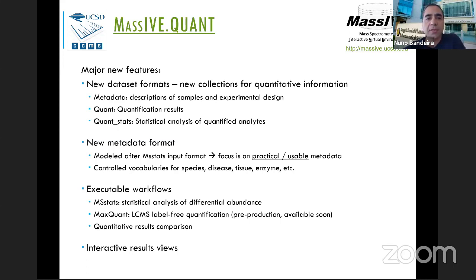So from that perspective, it also gets you a foot in the door, although definitely the preferable solution would be to have the tools that process the DIA file actually output at least one representative scan for each precursor that tells you maybe the peak of the elution profile, if not all the scans where the precursor is detected. So it's not a question of file formats, it's a question of support from the tools. And hopefully we'll get there in the not too distant future.